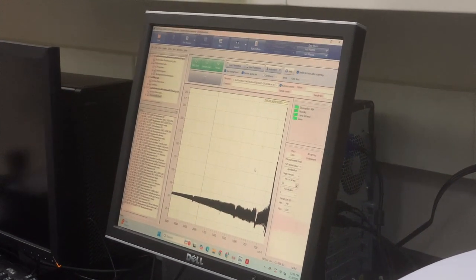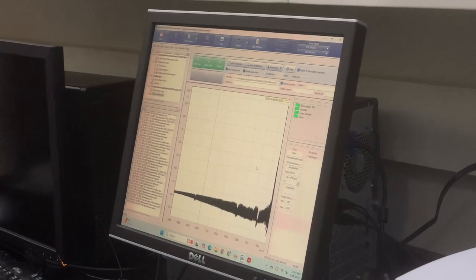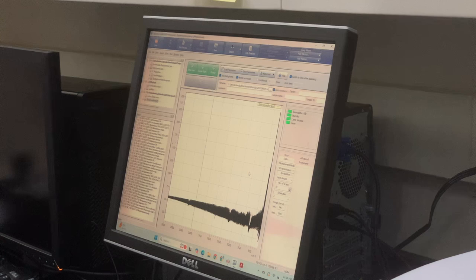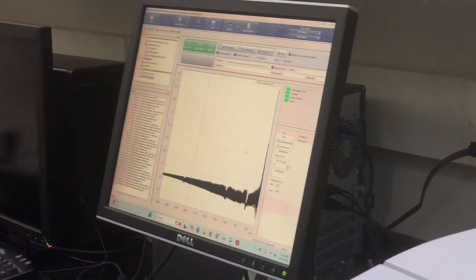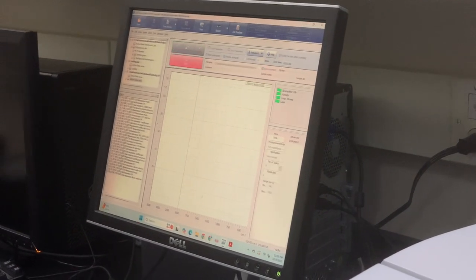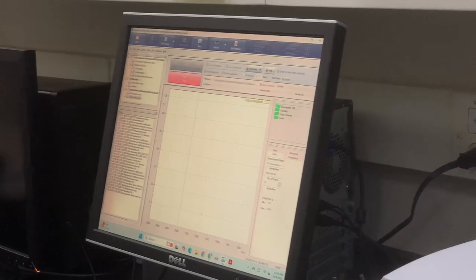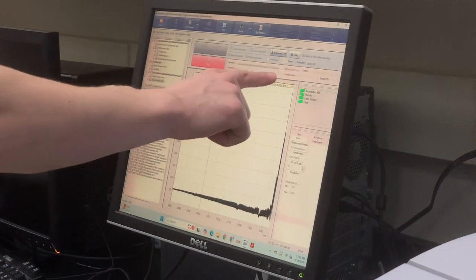Is there a layer that you could put on top of it that would make it less reflective? Well, I think we should try it with the ATR. Should we run a scan with 50 instead, so we can just see a little bit more detail here? Sure. If you want to try it, are you going to tell me I need to resave it? Yeah, I need to save over. It's going to automatically create a new file. Oh, yeah, auto increment.